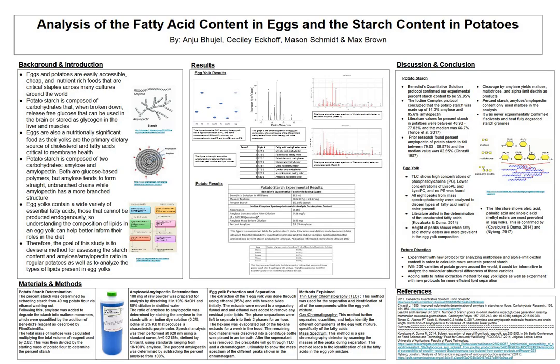So going over to our results then, we ended up using 8.5 milliliters of the Benedict's solution to fully account for all the maltose present. And based on the ratio in the chart down there, we just multiplied the 8.5 times that amount in grams of maltose that it would reduce, and then converted it to milligrams to determine that we had a total of 23.97 milligrams of starch-derived maltose present. And then dividing that by the 40 milligrams we started with gave us a percent starch of 59.93.